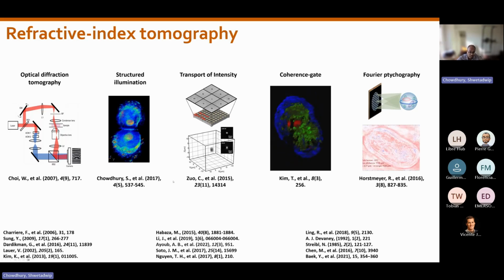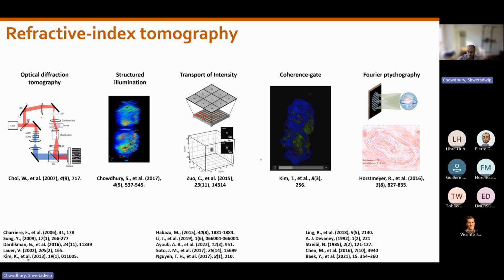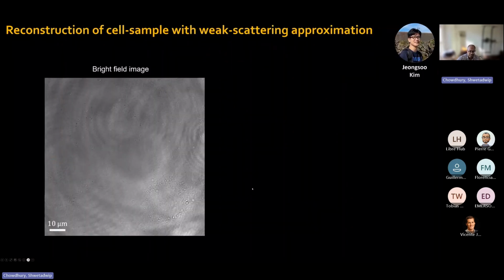And so this has found a lot of success in many fields in biology at this point, and is actively used in many applications now. Now, to give you a sense of this, here is a bright field image of a monolayer distribution of cells. Because this distribution of cells is weakly scattering, in the bright field image, you don't see much contrast, right?